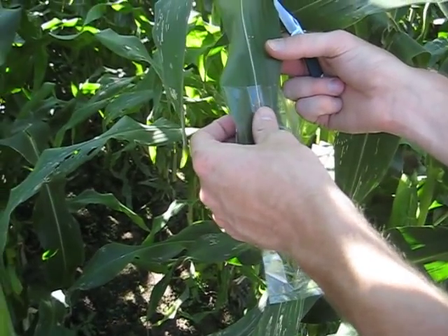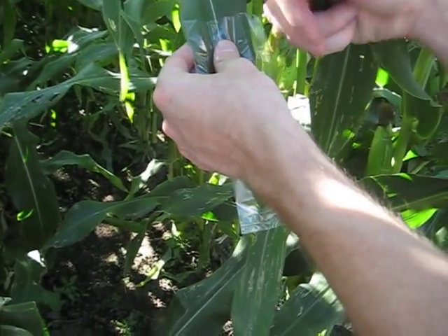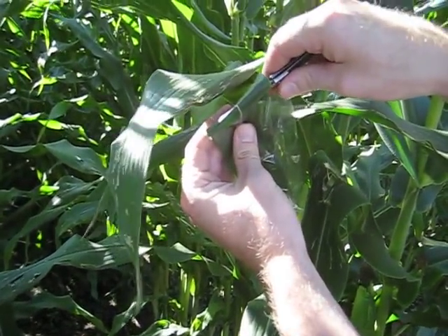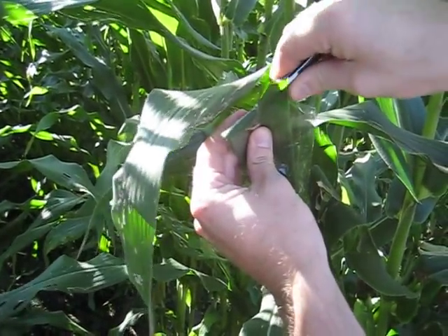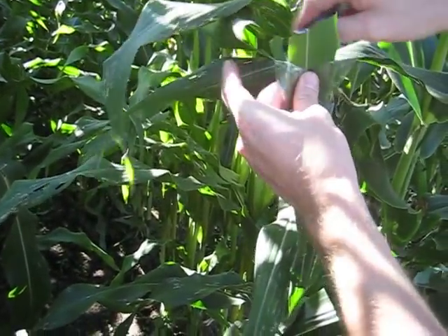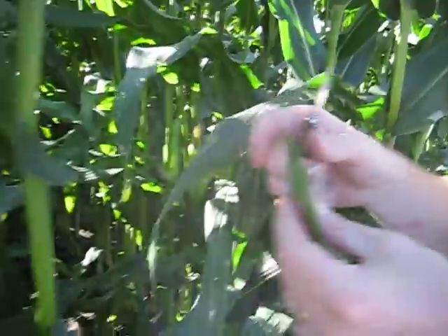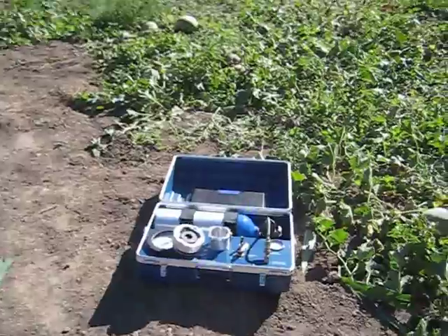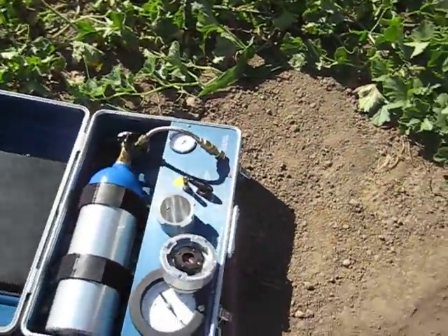You might use a pair of scissors; we've got a knife that we're going to use today. If you're going to use a knife, you can kind of crease the leaf and then slice through it. And we're just going to come back down here to the pressure chamber and seal that sample into the pressure chamber.